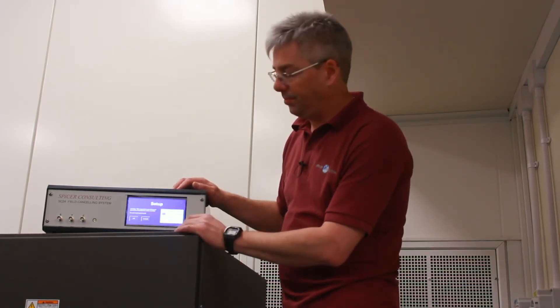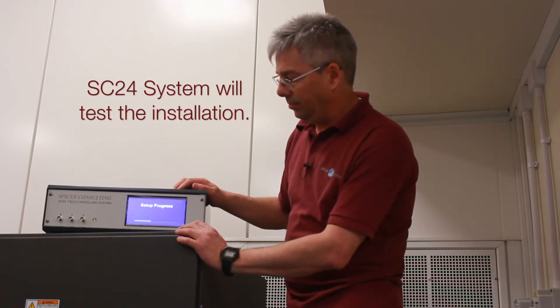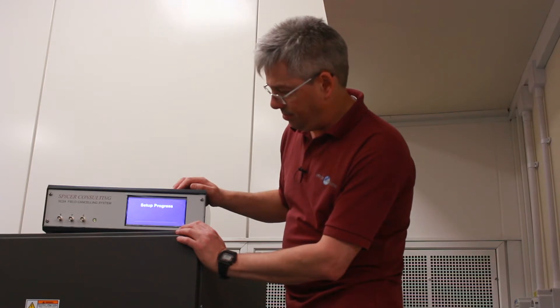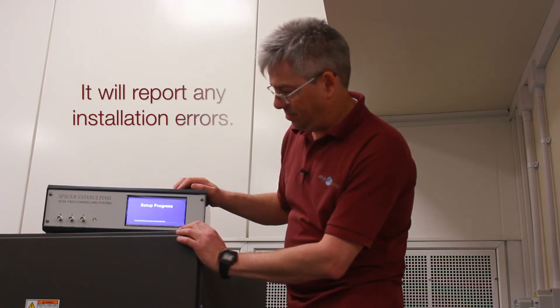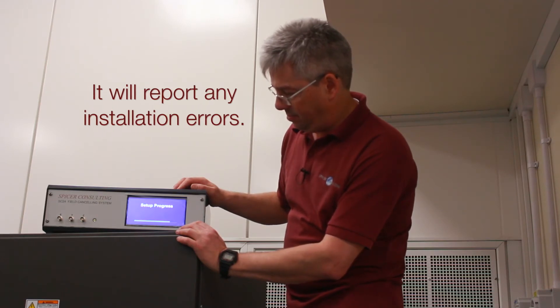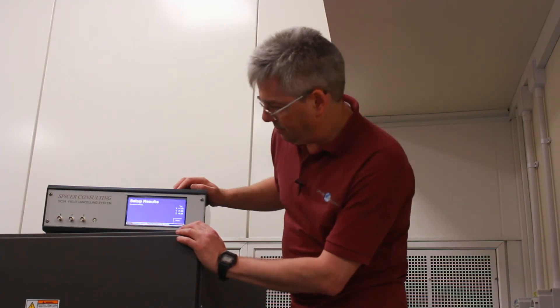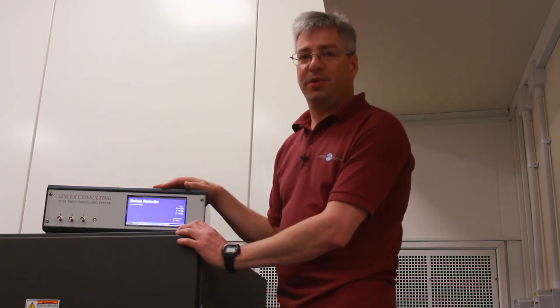I'll run setup. No errors or warnings — the system is working fine.